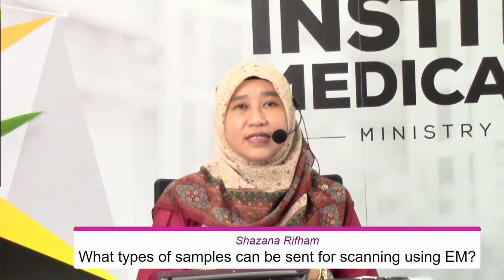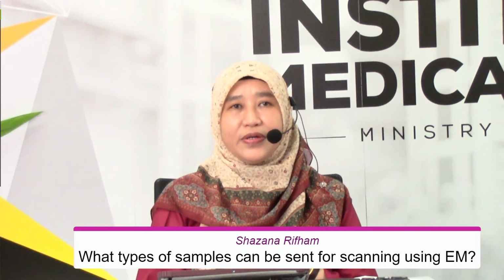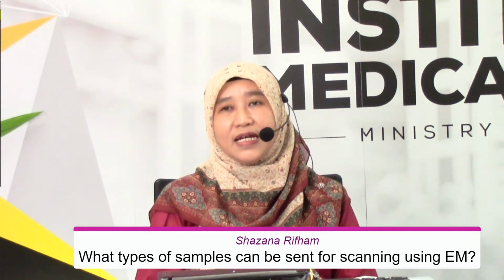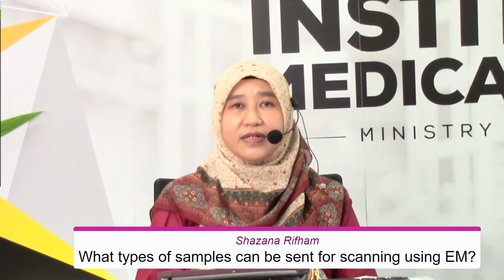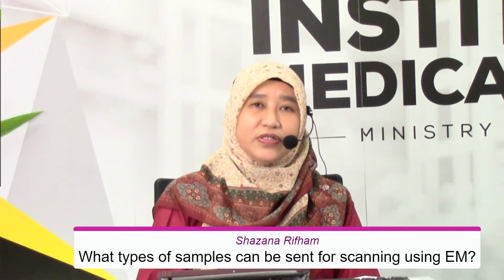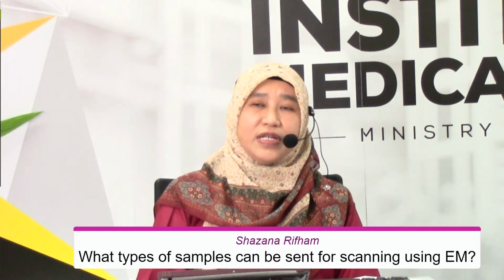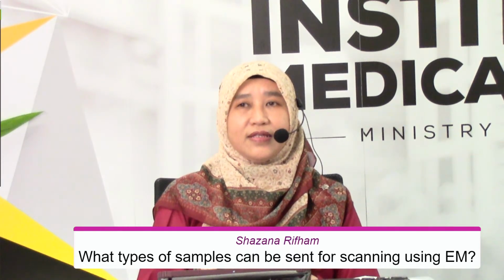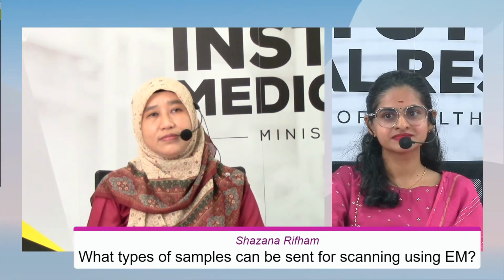the processing together. And one more thing, the limitation for scanning EM is the microanalysis part. Our samples are usually biological samples, not really material samples. But you can send that to us, and then we can explore together. Thank you.